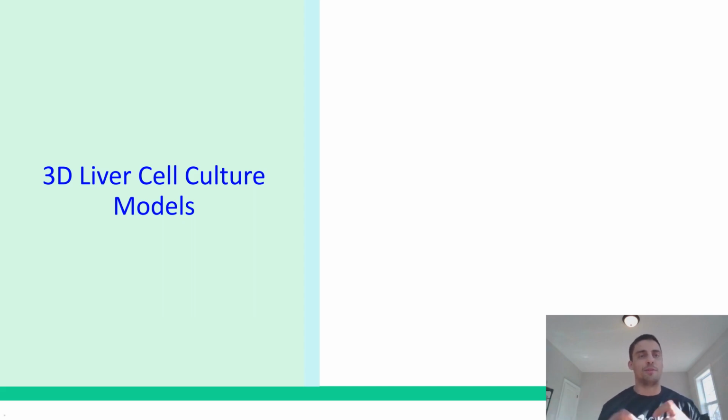at infiltration, penetration, and also cell-specific things like if we have a T-cell assay, where are those T-cells going? Are we getting T-cell killing? Where is it? Is it on the outside, the inside? So we're able to answer more complex questions and add a spatial context to the biology and to the research.